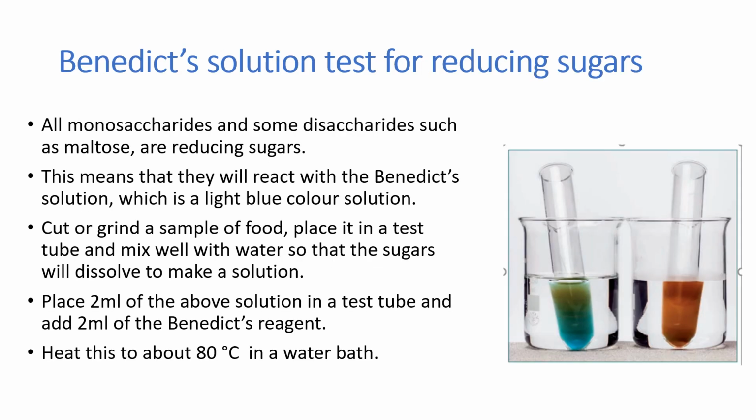Benedict solution test for reducing sugars. All monosaccharides and some disaccharides such as maltose are reducing sugars. This means that they will react with the Benedict solution, which is light blue in color.